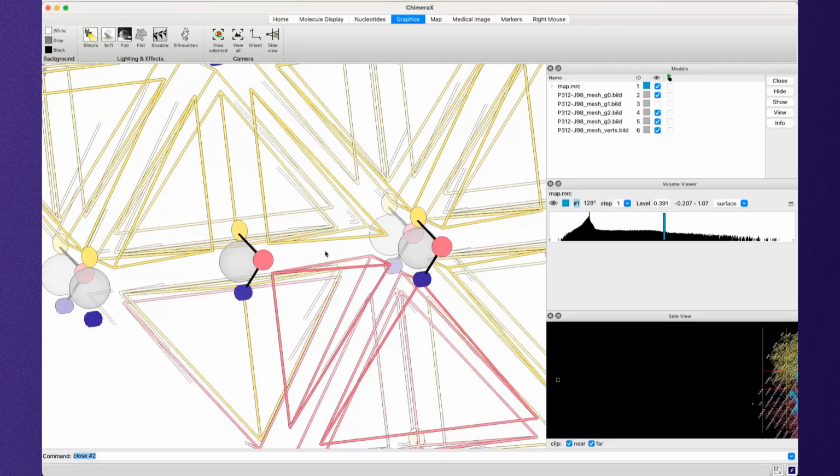That's what we want. We don't want the fab to be able to float up and away, which is what would happen if we allowed the yellow vertex to move up here to sort of compress up this way, but kept the pink down here. We want them to be attached to each other.